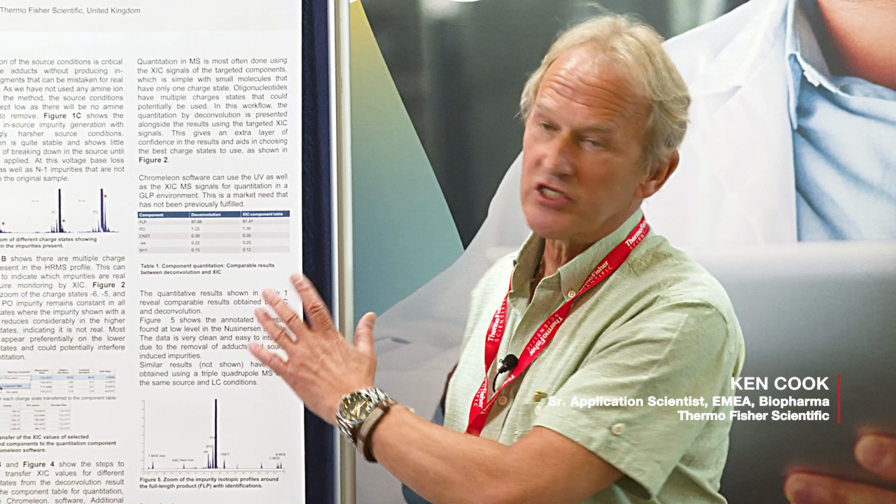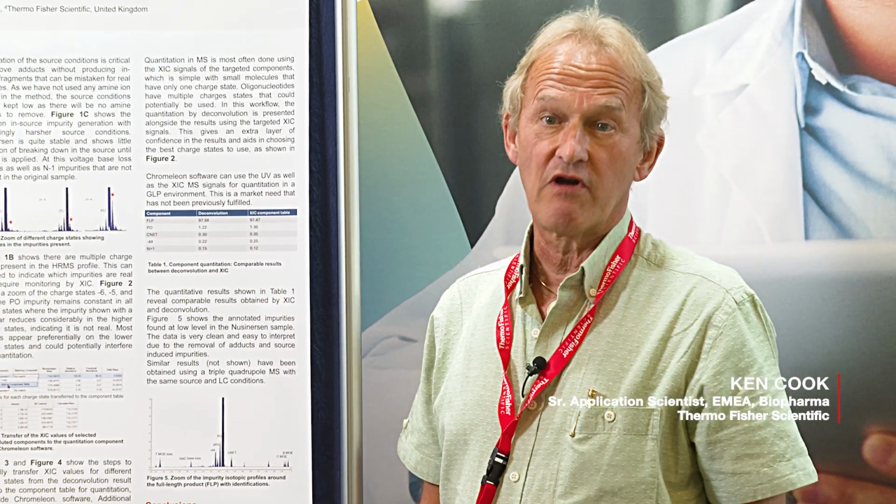Hi Ken, you're presenting a poster here at the HPLC conference. What is it about and why is this topic particularly relevant right now? This one's about helping the industry develop green chemistry for analytics.